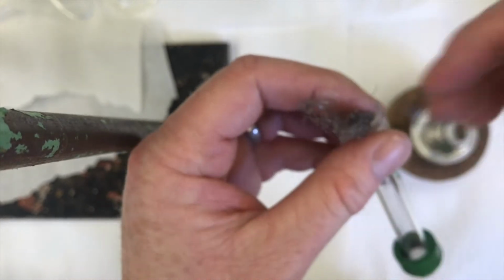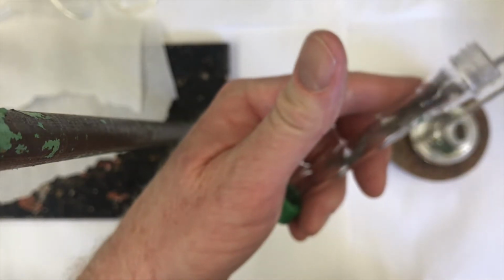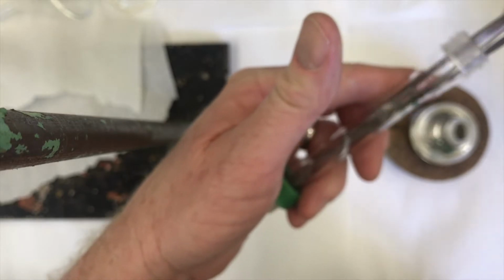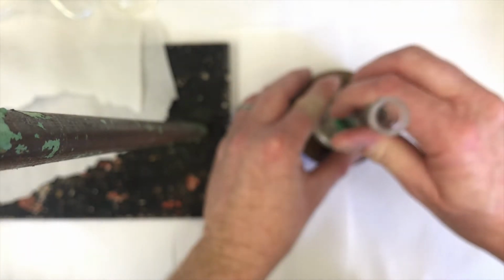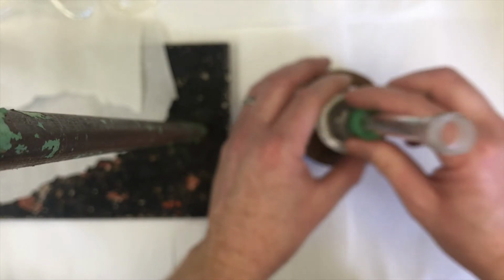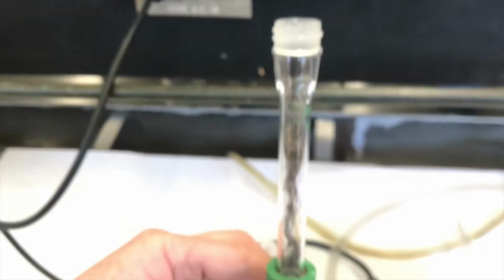This air condenser is just a straight glass tube. Pushing it down in with some tweezers. Okay, that looks pretty good. Got a little surface area there for the fractional distillation. And then I put that onto my round bottom flask. Okay, so I've got so far round bottom, stir bar, air condenser with the packing, so it's a fractional distillation.